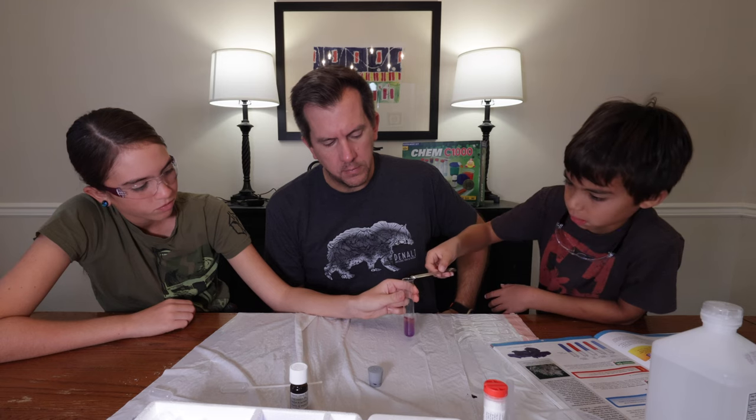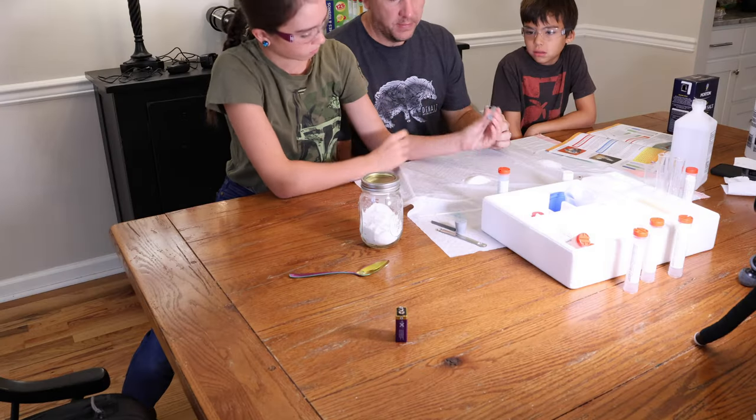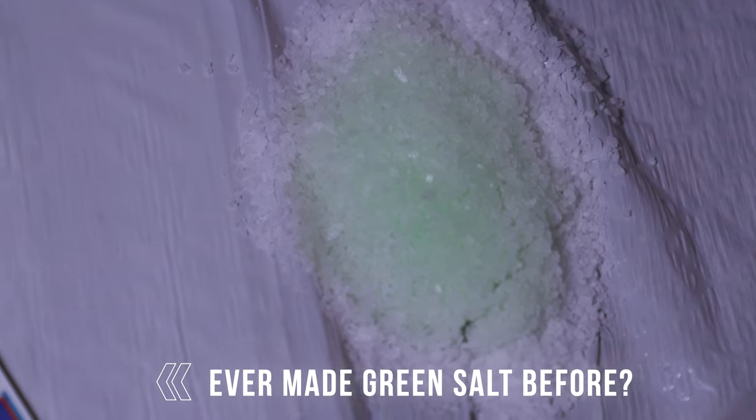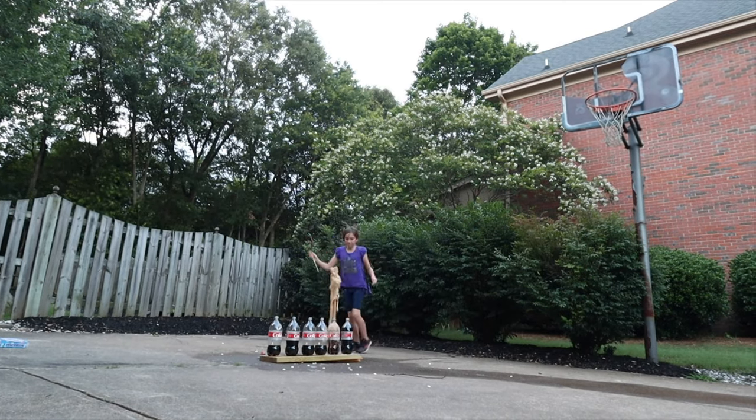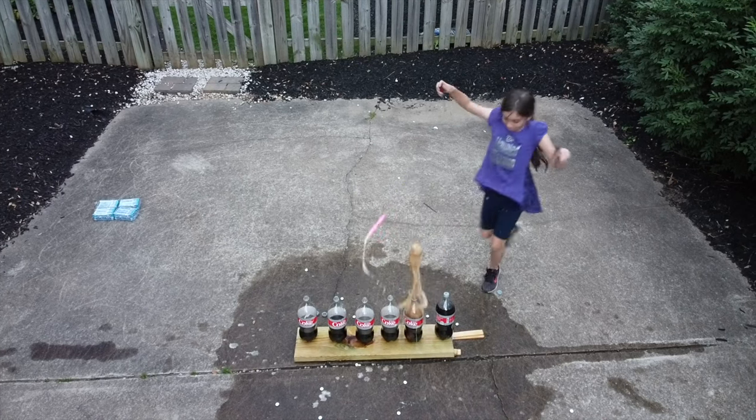While I thought the booklet was the best thing, my kids, of course, thought the experiments were — 'Whoa, purple!' So let's talk about those. These experiments are actually fairly advanced. You're not just going to be mixing baking soda and vinegar watching a volcano explode, or dropping Mentos in a Diet Coke bottle and seeing how fast you can run away from it.